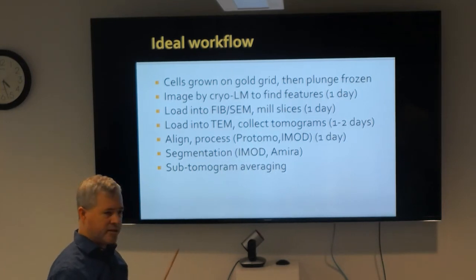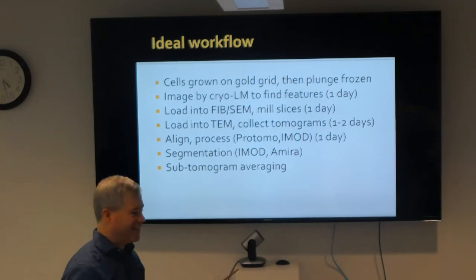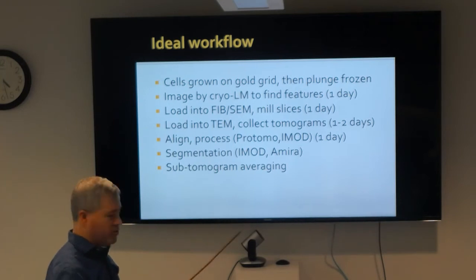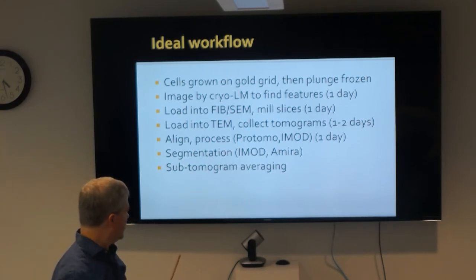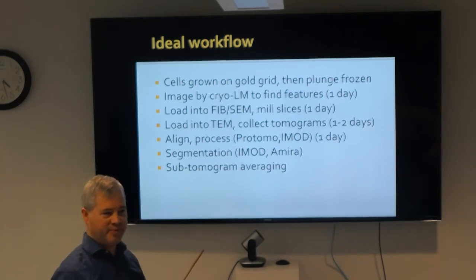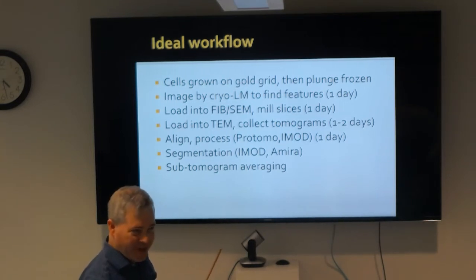In a day, I think Alice can do 8 to 10 lamella. Full day. From there, once you take it out, you can then keep it stored in liquid nitrogen until you get TEM time. You load it into the TEM, collect tomograms, 1 to 2 days. We can do up to 50 tomograms a day, I believe we're doing right now. Collection? Yeah. 100. 24 hours.